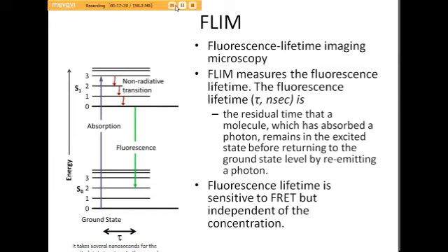The best way to quantify FRET is by using FLIM. FLIM stands for Fluorescence Lifetime Imaging Microscopy. FLIM measures the fluorescence lifetime.